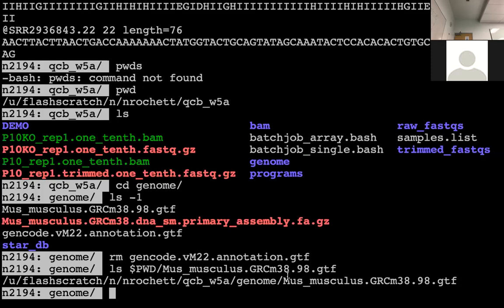and then we're going to need to copy that. You actually copy like this. Last time you mentioned this. On Windows versus Mac, the terminal is better integrated on Mac, and possibly you can use Control Shift C, Control Shift P, okay, or just Google it. Yeah, okay. So there are ways to make it work.